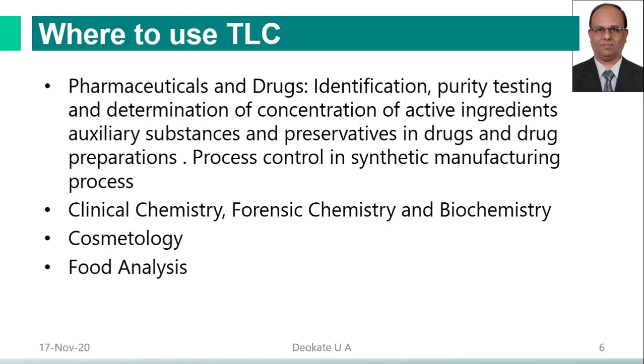In food analysis we are using thin layer chromatography, and in environmental analysis, to separate out the pollutants, we are also using thin layer chromatography.